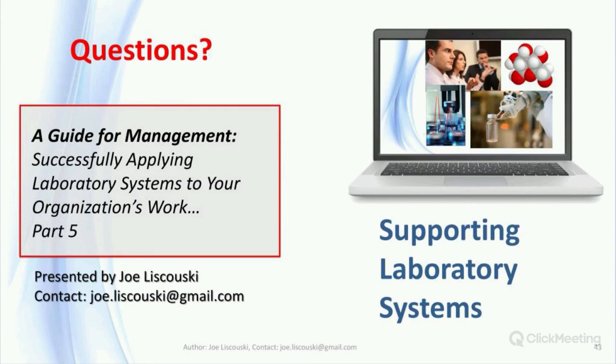Well, I'm not sure what you mean by a hybrid, but I think each site is going to need its own personnel just to get a timely response. But if you really have a global lab, you need to have an organization where you have local support for the LAEs and then have them periodically get together so that people understand what's going on at different sites, where there might be common problems and common solutions to those problems, and so that coordination can get done properly.